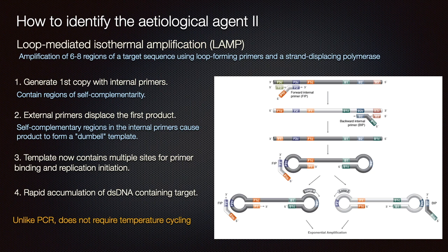Our final nucleic acid-based assay we're going to discuss is called LAMP, loop-mediated isothermal amplification. LAMP is a low-cost alternative to PCR. It does not require an expensive thermal cycler or other equipment. As such, it's very valuable when it can be deployed in the field, and it yields rapid results, often within 10 minutes. Those results are usually the accumulation of some colorimetric reagent.